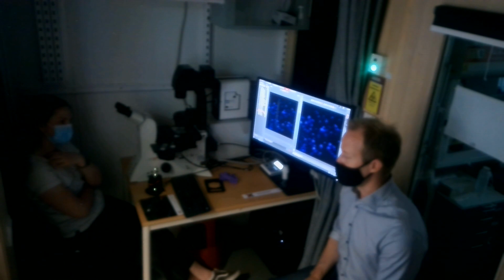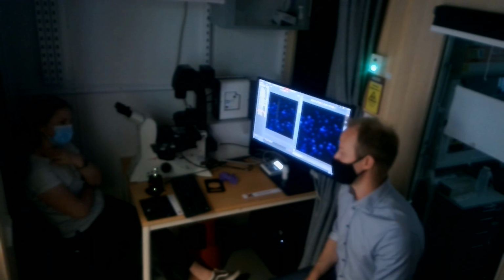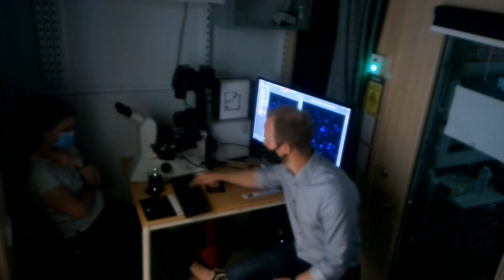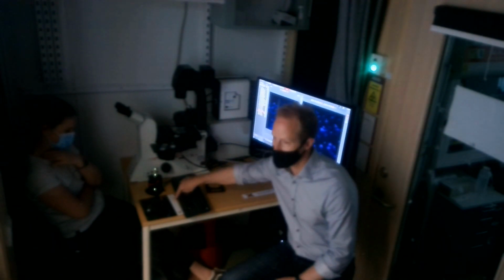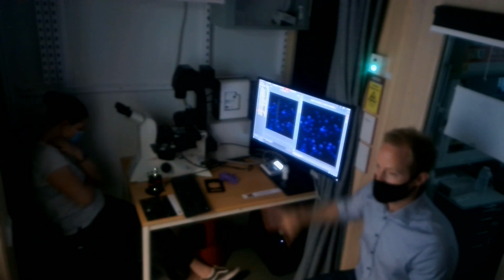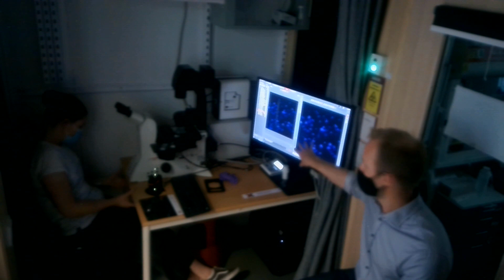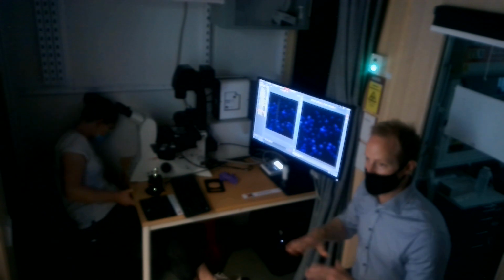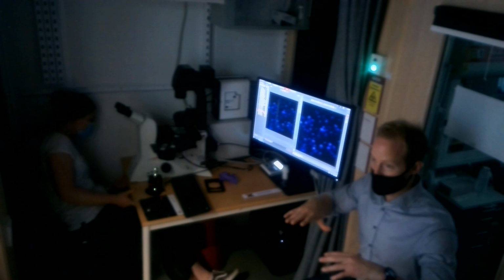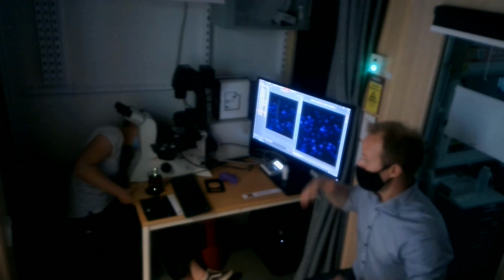Yeah. As I know. I don't know that technology exactly, but that sounds more like, so Leica came out with something with this nice thing here, Thunder Imager Systems. The Thunder Imager system is built on the same type of microscope, but it has a bit more functions when it comes to creating better images. That one will actually analyze each frame and look for what is coming from out of focus, what is coming from in focus, and decide between them.